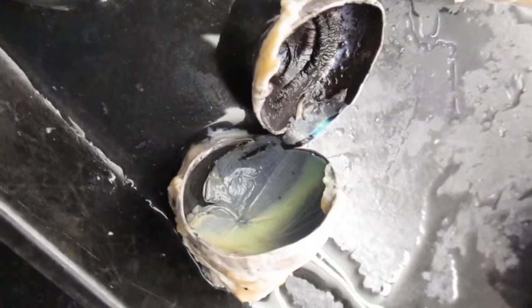And there's another thing here. It's a clear, shiny stuff here. Let me sort of play around here and remove the retina a little bit without destroying anything.